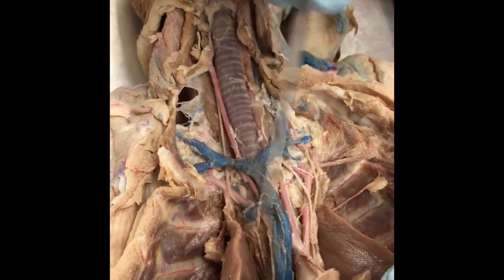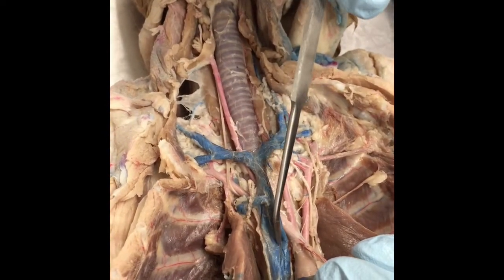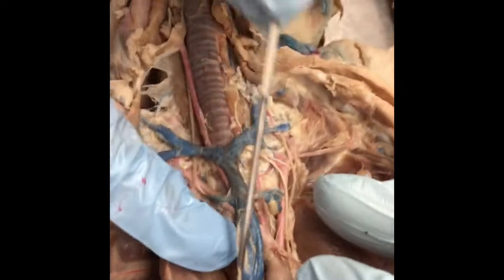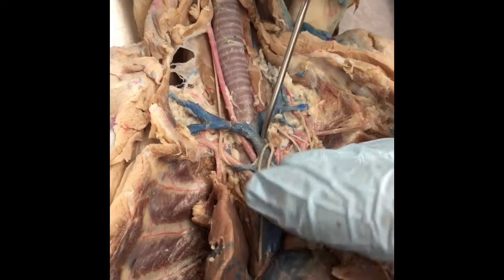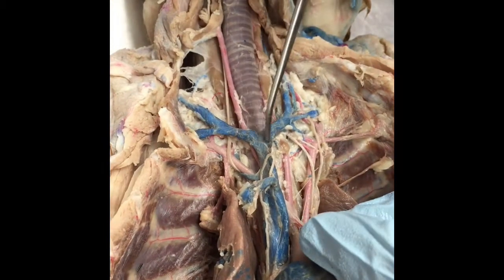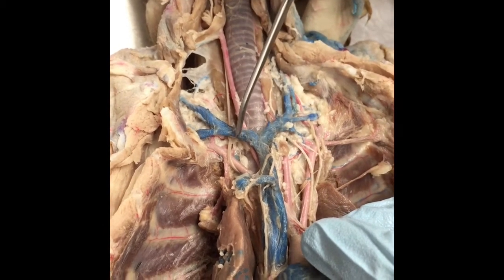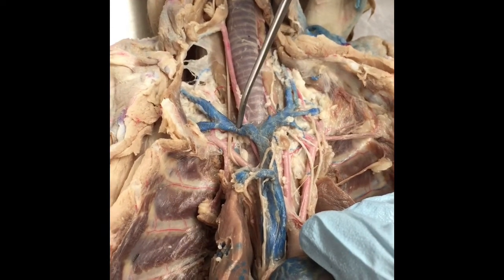Now for the veins. This is the vena cava, the superior vena cava or pre-vena cava. In the book it's the anterior vena cava, the same thing. And so this is the internal mammary, but that's not important. This is important: we have two major branches, the brachiocephalic veins, left and right.